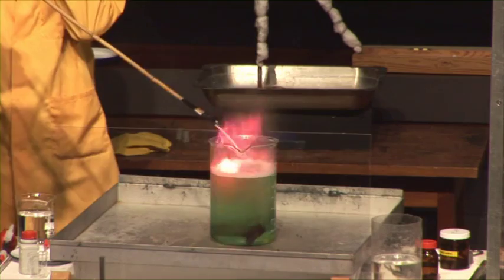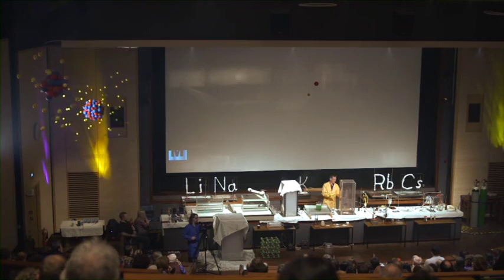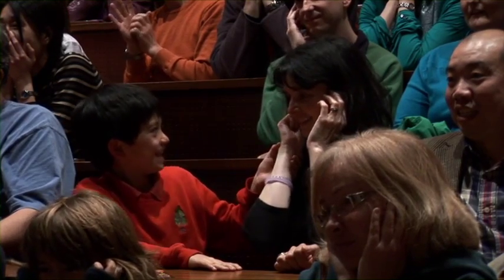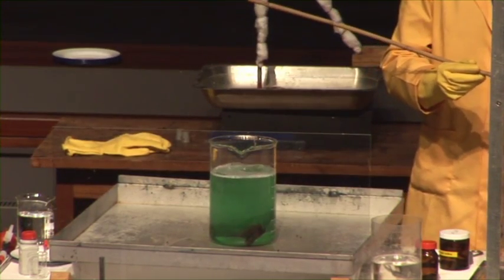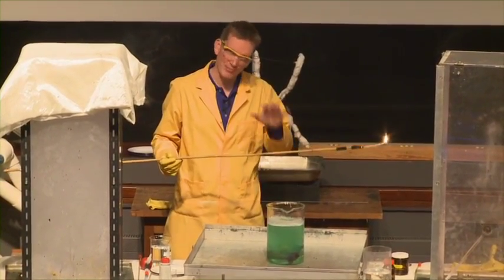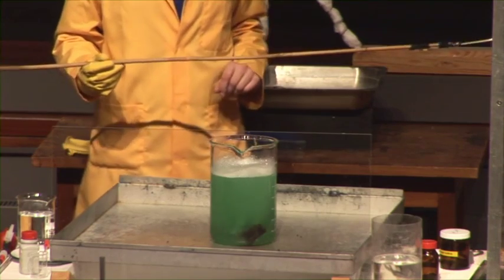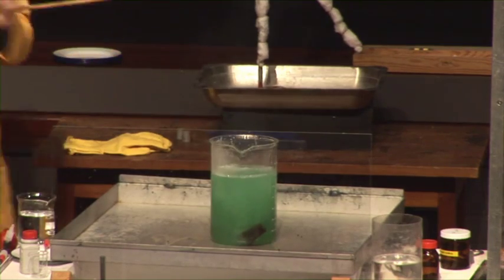Maybe it won't go bang yet — well, let's see. Not bad. But I'm sure we can get a louder one than that if we get them to mix properly. Let's apply a light now. If you don't like loud bangs, I do recommend putting your fingers in your ears. This could get quite loud. Getting quite loud — I'm sure we can get louder than that. Let's just wait for a few more bubbles. This is the mixture of hydrogen gas and oxygen gas mixed up in the right proportions — the hydrogen coming from sodium hydride, the oxygen coming from potassium superoxide. There are quite a few bubbles here now. That's certainly quite loud.